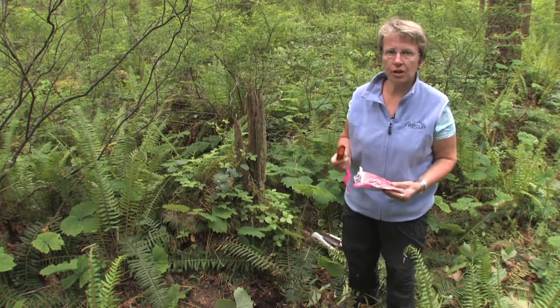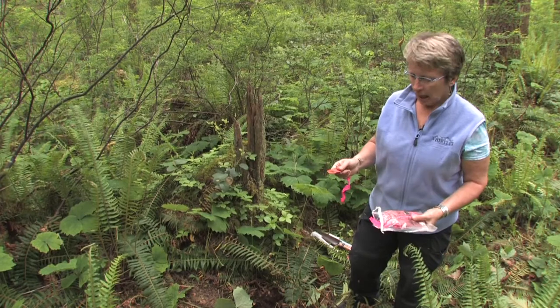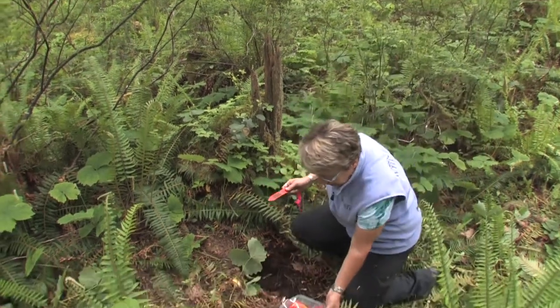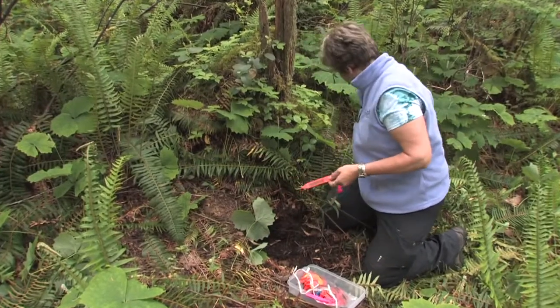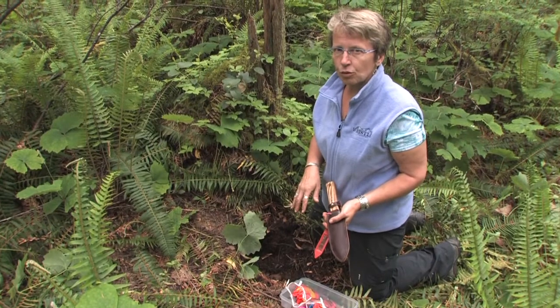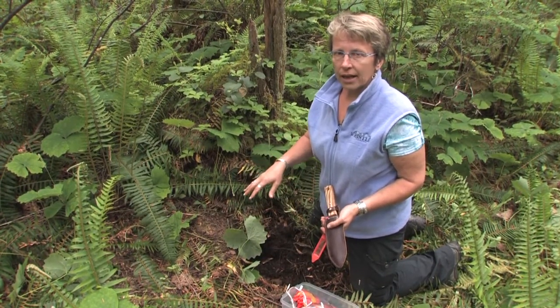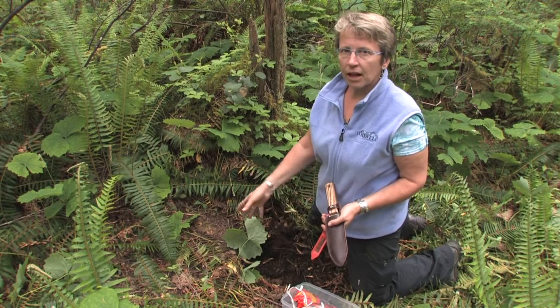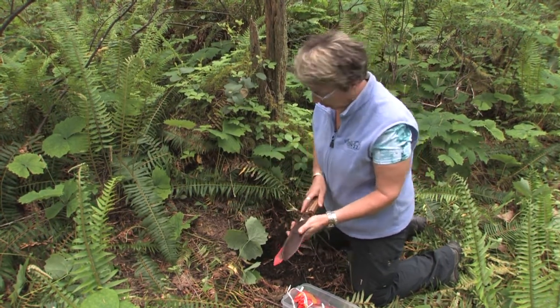I'm going to show you now how we do the insertion of the probes. For each location we have four anion probes and four cation probes that we place within the forest floor layer and the mineral soil layer, and they're analyzed together as one composite sample.